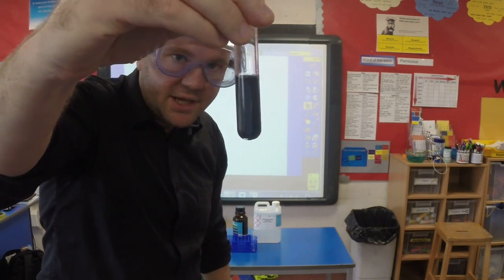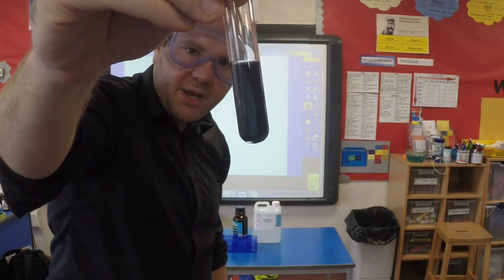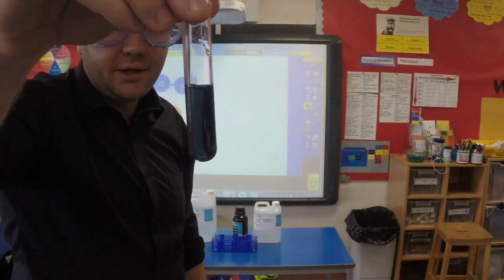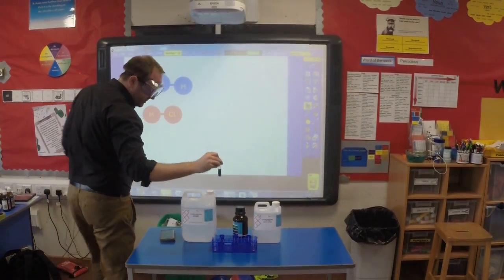If I give this a shake now, well actually we've gone much too far the other way, so obviously that's a little bit stronger than I intended there. Or maybe I gave a bigger drop there. That's gone to quite a dark blue colour, which tells us it's gone really quite alkali. Which wasn't what I intended to happen, but let's see if we can remedy this.